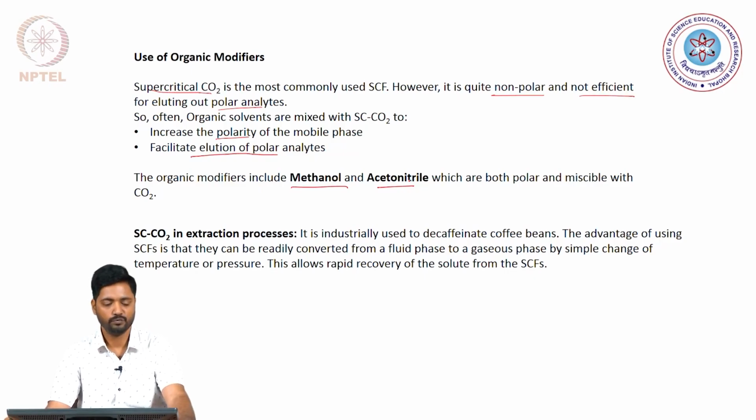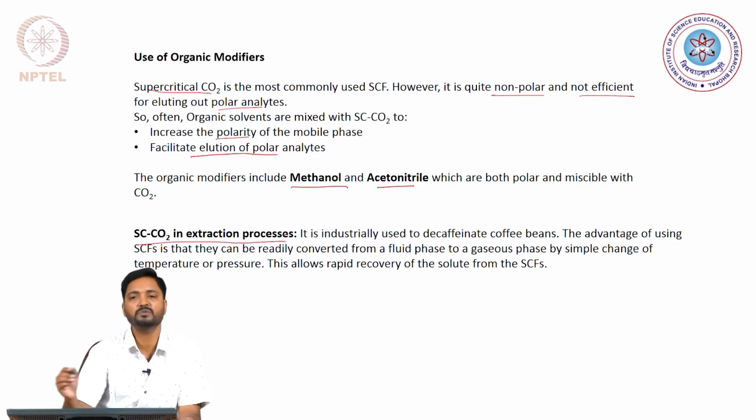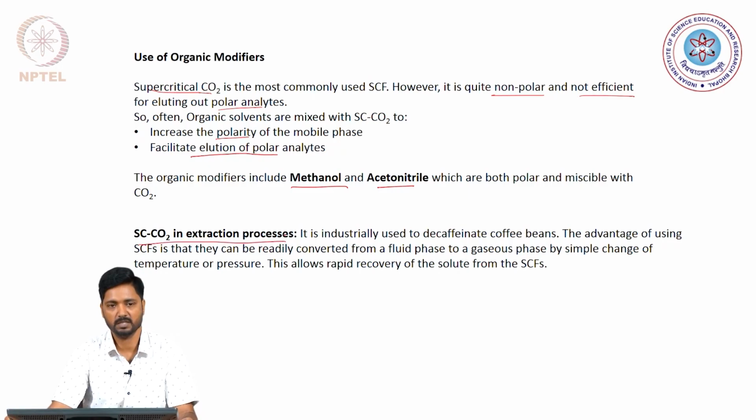Because of its unique nature and easy conversion from a supercritical phase to a gaseous phase, supercritical carbon dioxide is also used in extraction processes in industry.